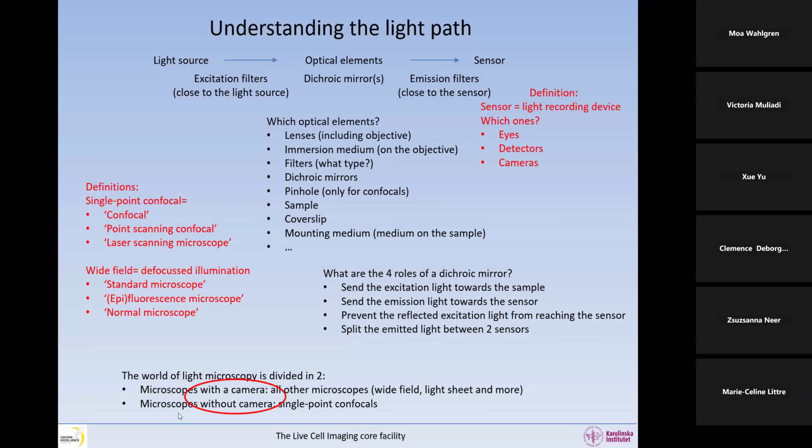And so it's very simple in some ways. You need to recognize what a microscope is when you look at it. You need to check if it has a camera or not.